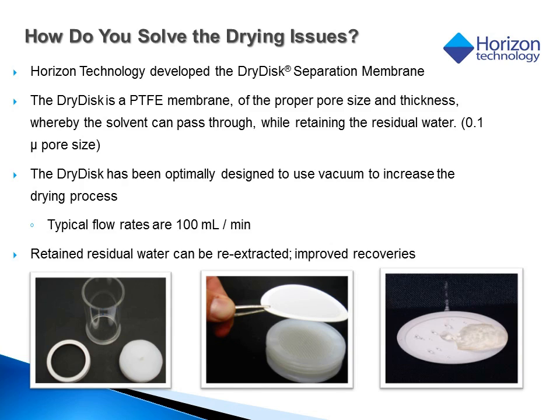Polar solvents like methanol or solvent extracts with acetone higher than 30% will carry water across the membrane and will not work. It was for this reason that it was important to develop a methodology that did not exclusively use acetone to elute with.